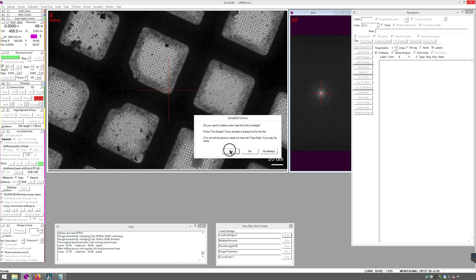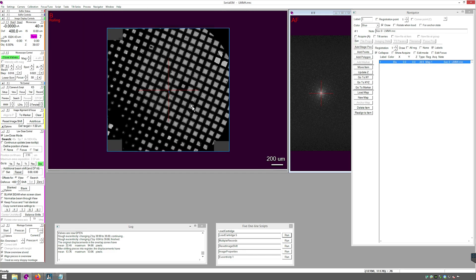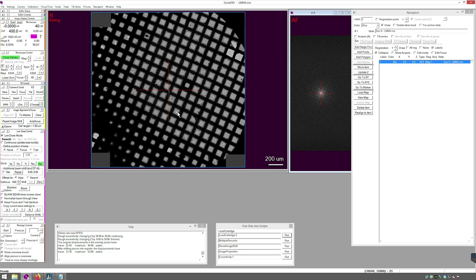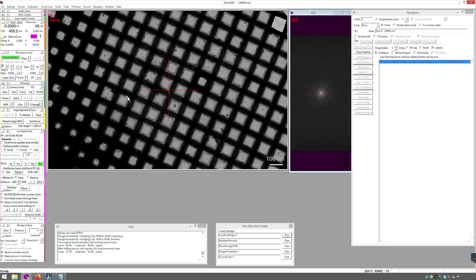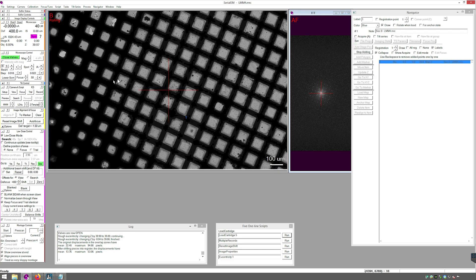Click Yes to add the map to the navigator. Zoom out and look at your LMM. Find the grid squares you'd like to collect on. Add points to them using the Add Points button. Click Stop Adding when done.